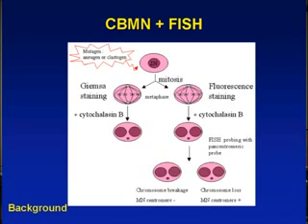Okay. Now, if you compare these two types of micronuclei, one with the probe, the other one without the probe. The one without probe means what? It's an intact or part of a chromosome. It's only part of a chromosome. Otherwise, you should have the probe there if it's an intact chromosome.